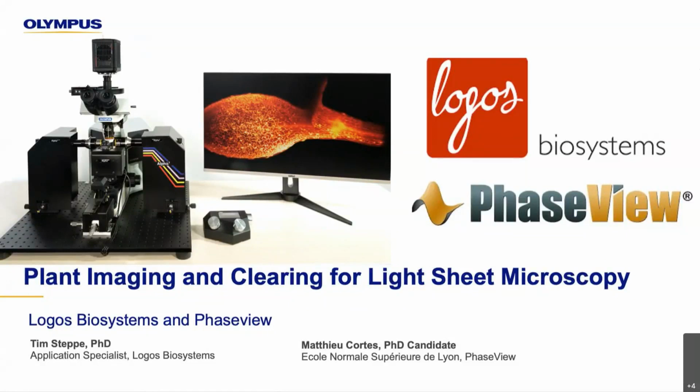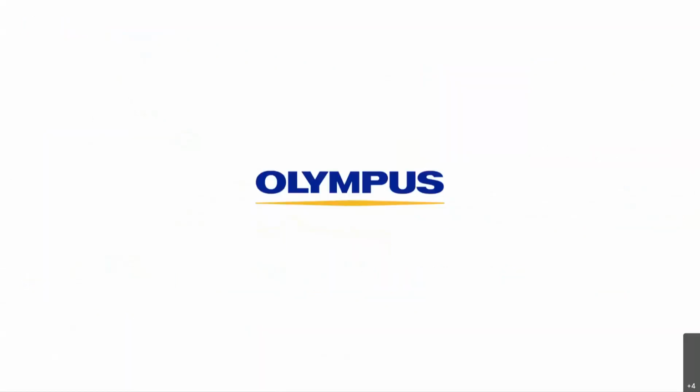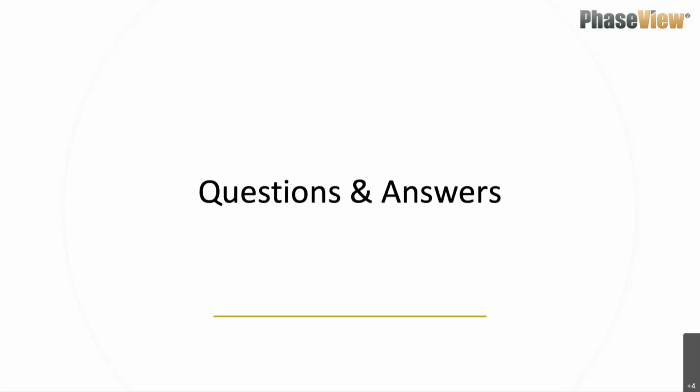Okay, so the first question I think that we got was, are there any references of X Clarity in plant tissues? And the answer to that is not quite yet, but in about a couple of months, there is a different French group that will be releasing a paper published in one of the Nature publications. I'm not exactly sure which one, that deals with X Clarity and plant clearing and imaging.